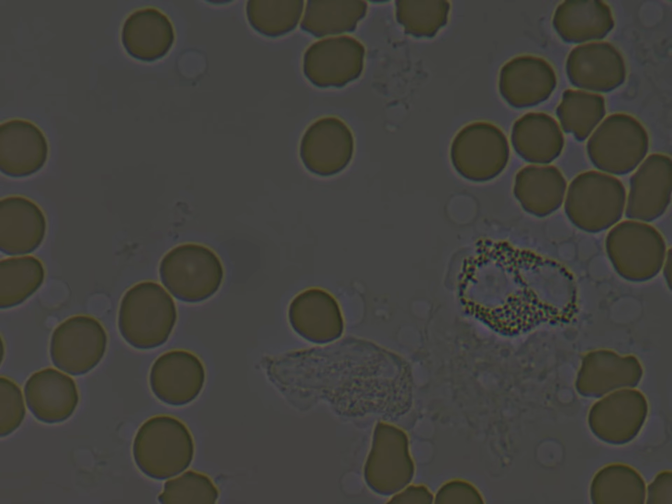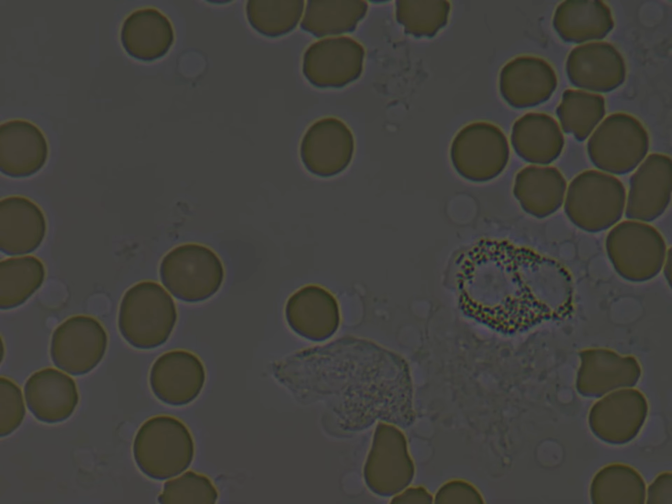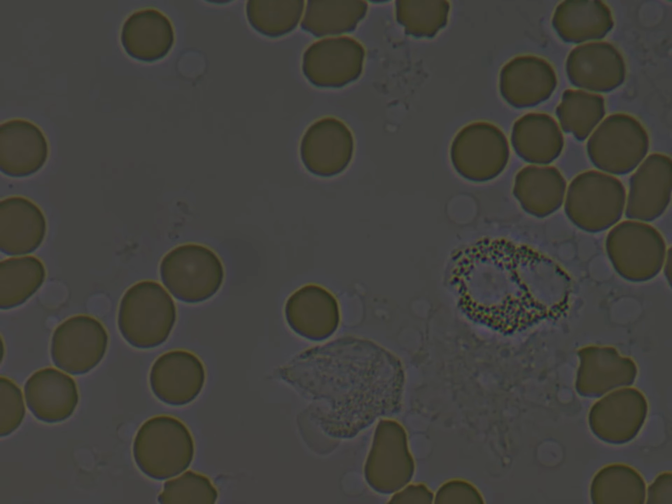This video was created with the Dianel-Micro software using a professional microscope with plan achromat objectives.